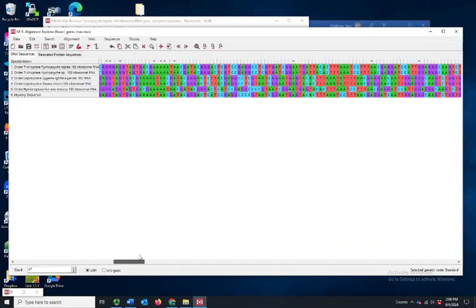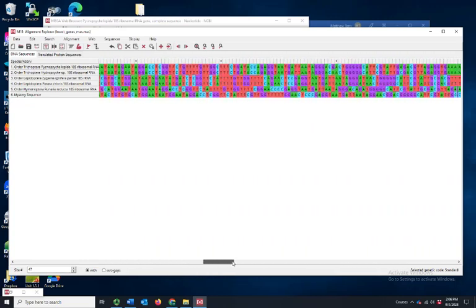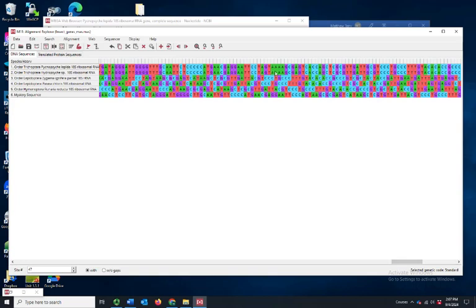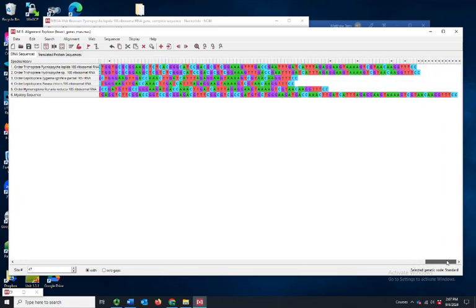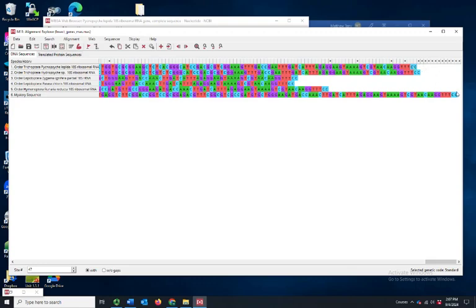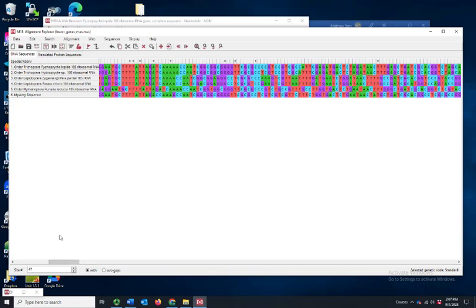And even though we can kind of see the patterns, they're not really lined up well. So although there are still similarities, by the time we get near the end of the gene, only very closely related species are still showing high levels of similarity. And even those, after a while, might become a little bit shifted and off. So notice, even at the end, we see that some sequences are longer than others, right? So I want you to maybe just refresh your memory.